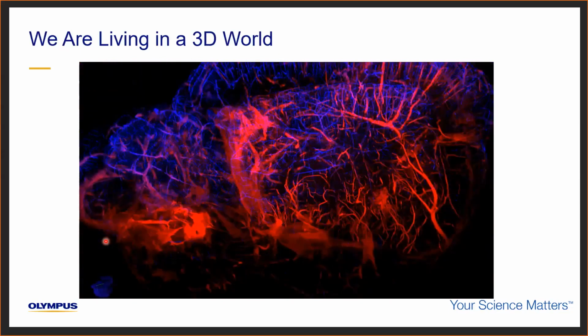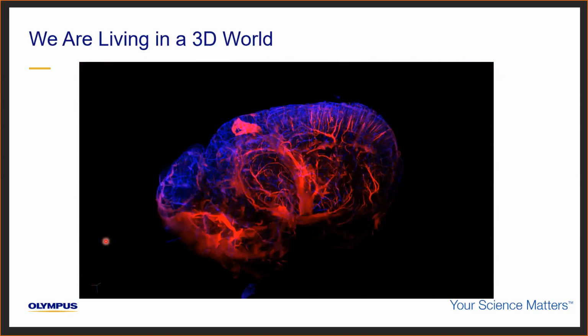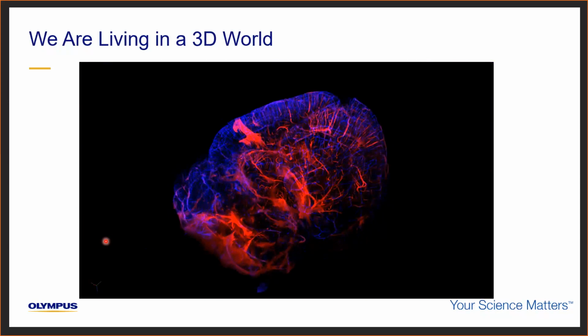From such data, you can study several factors, such as regions where the density of vasculature is higher compared to other regions of the brain, and then you can further deduce the reason for the same. Now, as all life forms grow and develop in three-dimensional space, it is critical to capture imaging data in X, Y, and Z planes with high resolution.